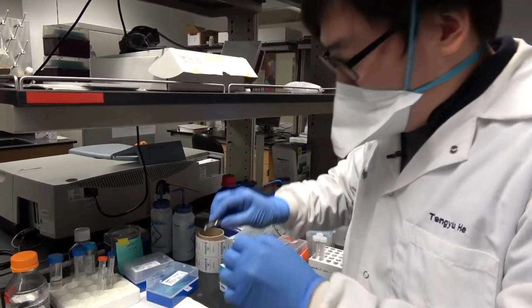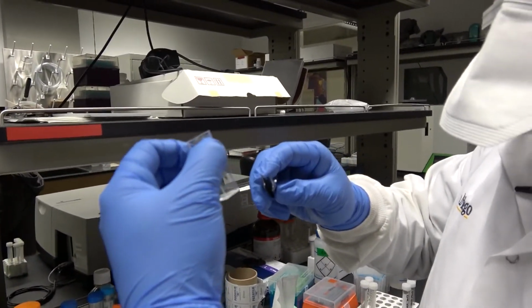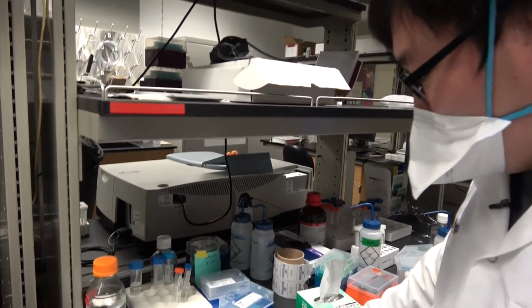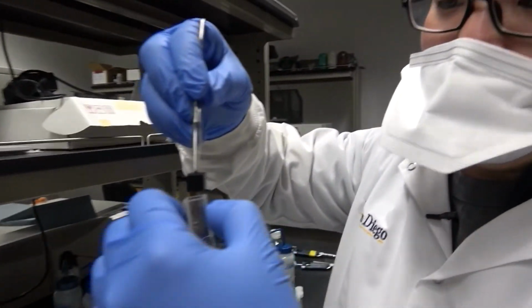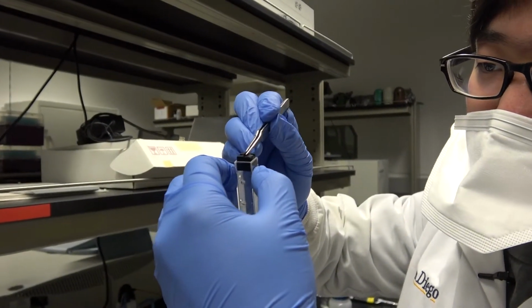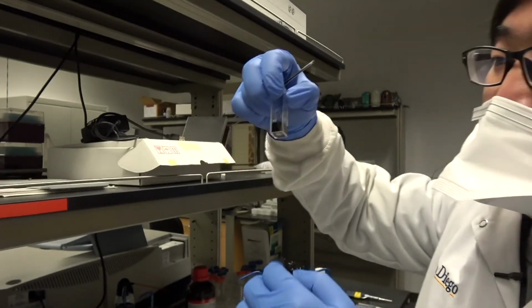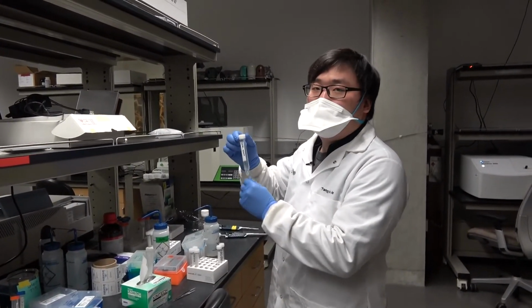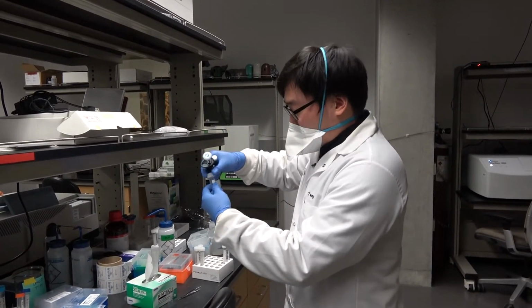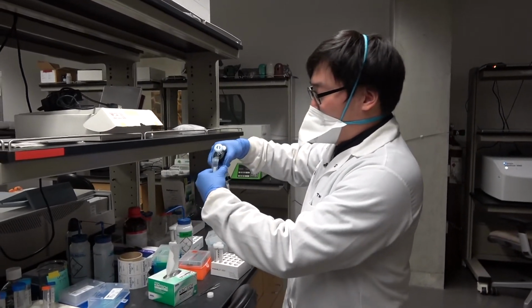Now I'll put in the stir bar. I will explain why we need the stir bar later, and then insert these black things, which are designed to stabilize particles later. Now I will start from the smallest particles. I'm going to transfer this particle solution to the cuvette.